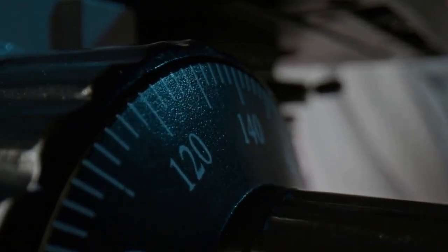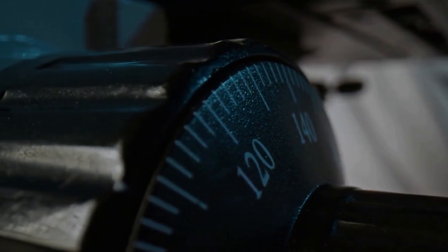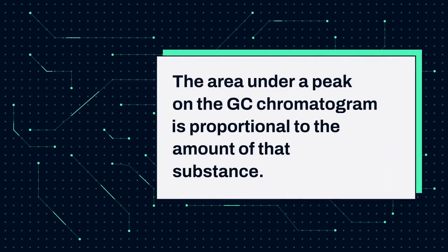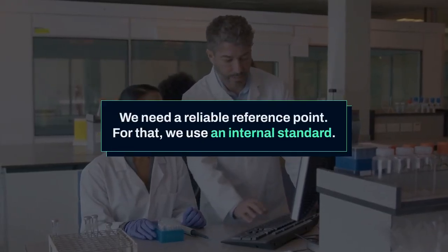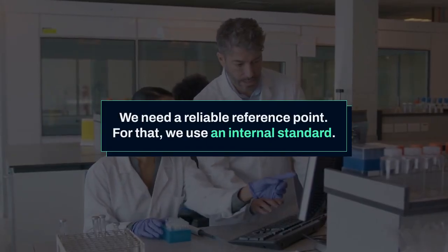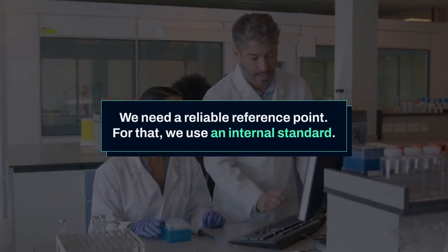The GC is a fantastic tool that helps us find the actual amount with high precision by separating the components in our final reaction mixture. The core idea is that the area under a peak on your GC chromatogram is proportional to the amount of that substance. However, we can't just use that raw peak area. We need a reliable reference point, and for that, we use something called an internal standard.